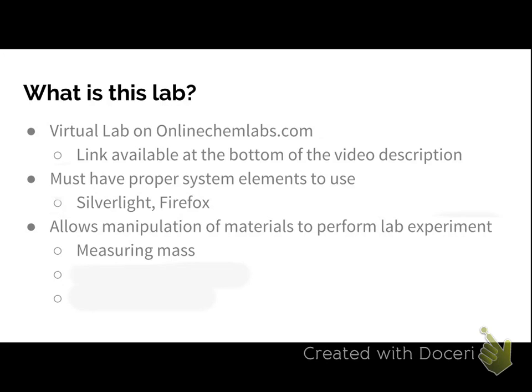It might add 0.98 grams. So it gave a realistic feel to measuring the mass, that you're not going to get exactly what you are looking for every single time. There was pouring substances, moving it from one place to the next, adding syringes, and then discarding waste.